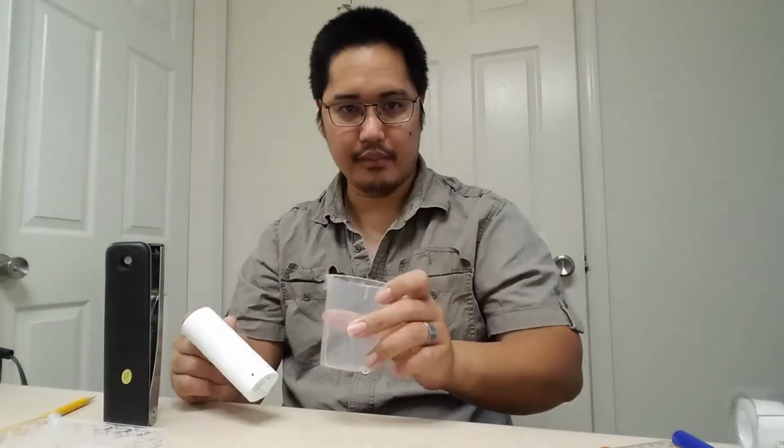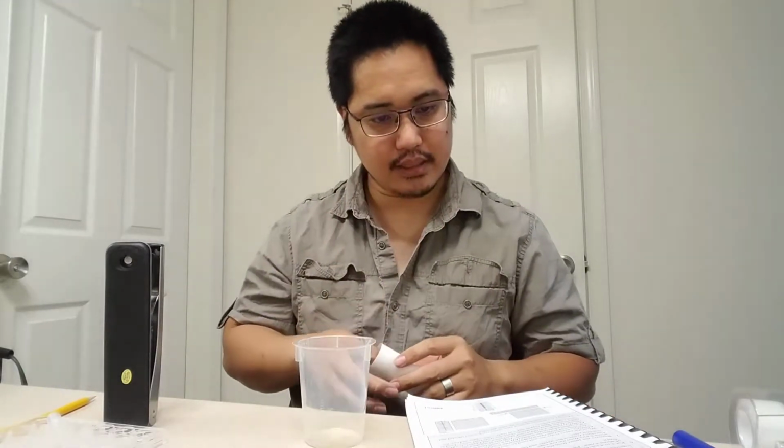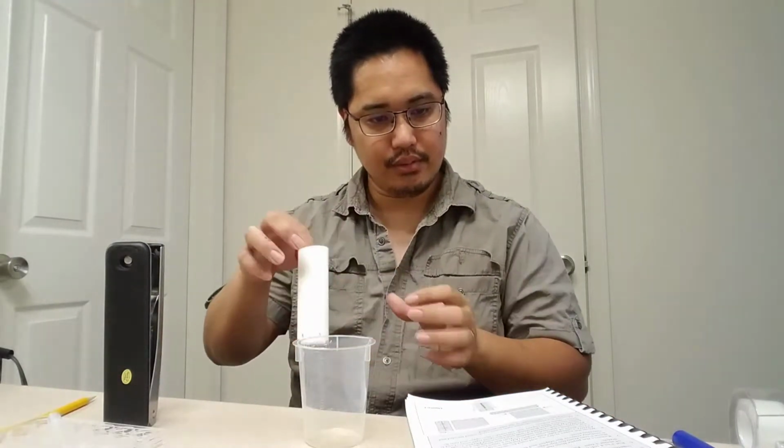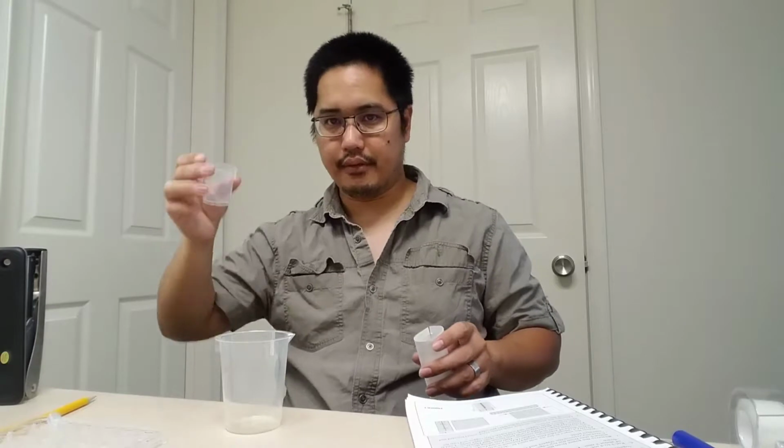Now I'm going to take my 150 milliliter flask or cylinder and my beaker, and I'm going to pour in about 3 milliliters of distilled water. So here's some distilled water. This is at about 4. Let me just make it about 3 to 4. All right, that's about 5. Okay, that's good. All right, so I'm going to pour it in here. So not a whole lot. It's just enough to coat the bottom of the beaker.